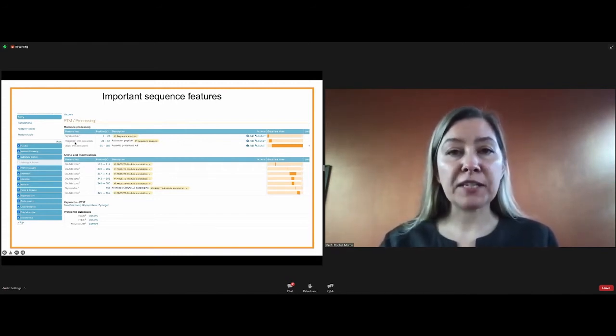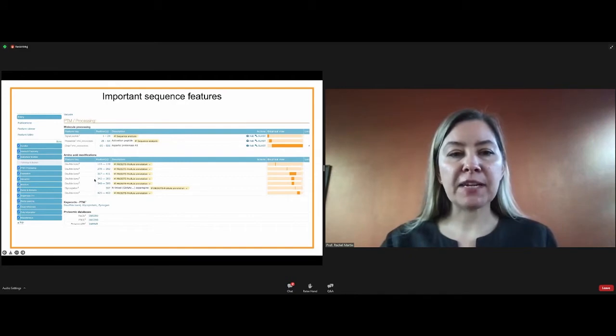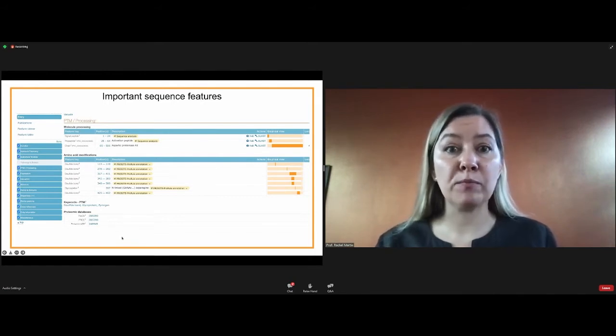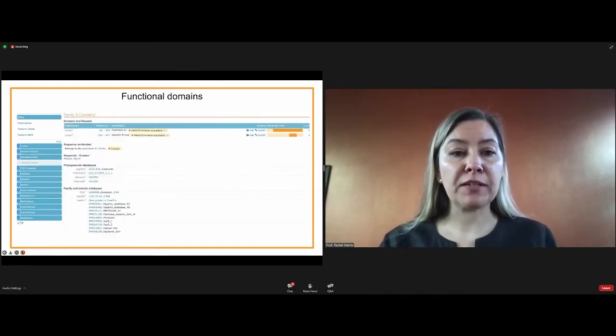And it has that pro sequence that covers up the active site before it's ready to go. The rest of the protein, here it just says chain. That's the main functional domain of the protein. We also have some disulfide bonds, and it tells you where they are. There's a glycosylation. All of these kinds of modifications that might be important to the protein function, the ones that are known, are going to be listed. They will also have citations for where these things are published if you click through. So there's our important sequence information.